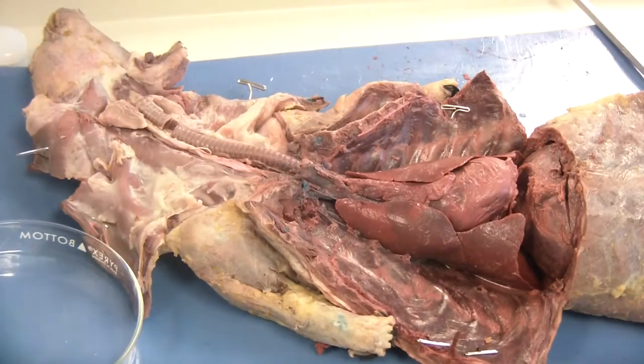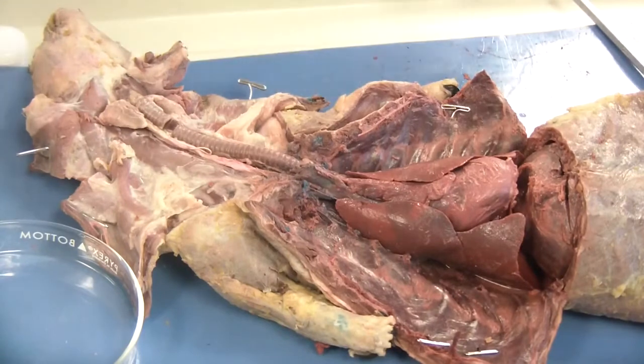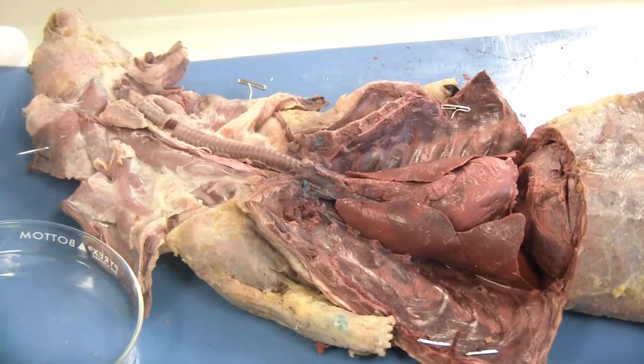I am not going to show you what happens because I want it to be a surprise when you see it on your own mink. Step number two asks us to locate the esophagus. We do not want to cut the esophagus — we are going to keep it intact for when we study the digestive system.